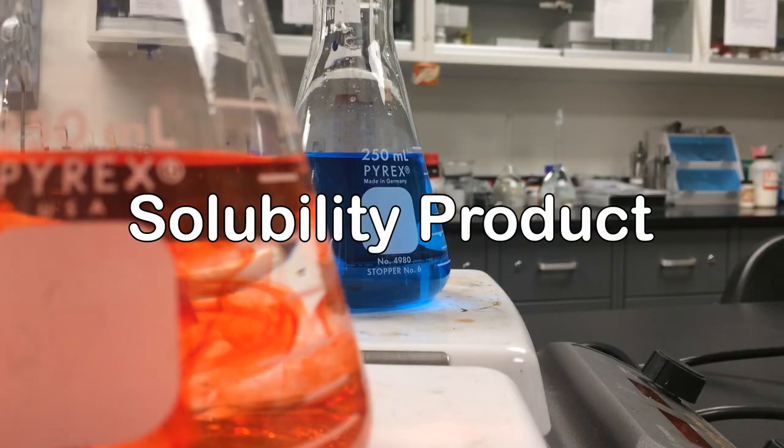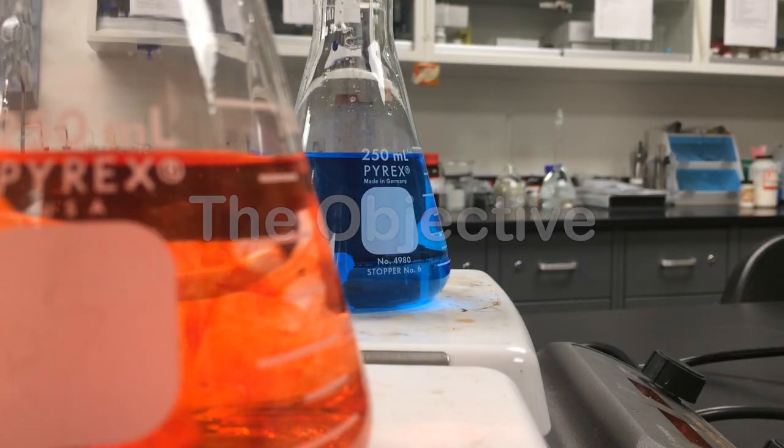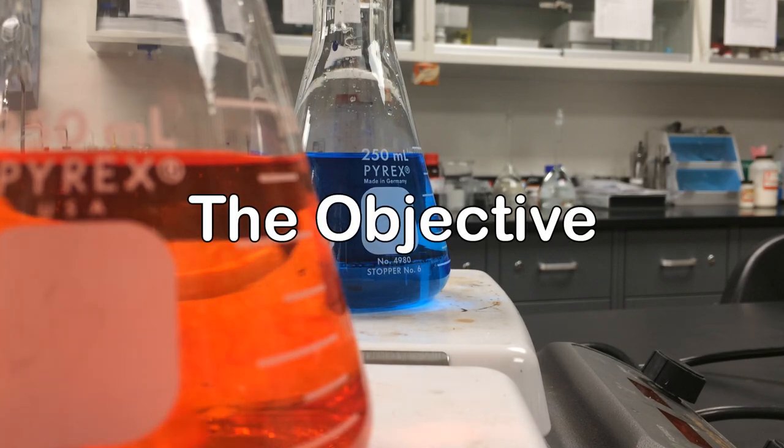Chemical Equilibrium II, the solubility product. The solubility product of potassium hydrogen tartrate is measured out and the effect of a common ion on its solubility is examined.